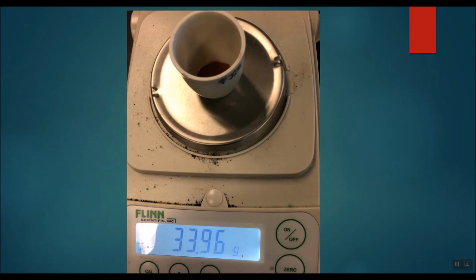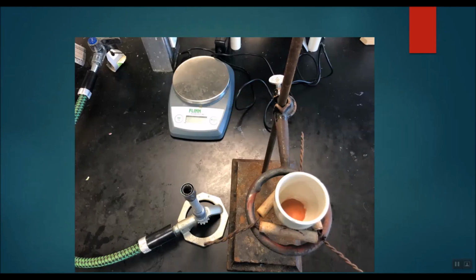33.96 is the answer. So we now have the mass of the copper in the crucible. That reading is going to be almost 96% crucible, and the rest is copper. The rest is what we need.